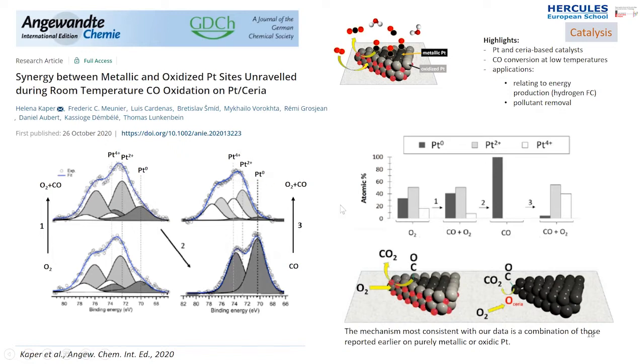You can see that the platinum 4+ is decreasing, and on the other hand, the metallic platinum is increasing. However, the contribution of Pt2+ is unchanged.